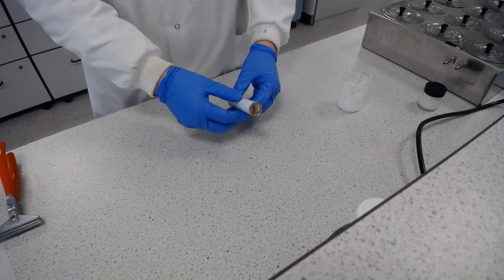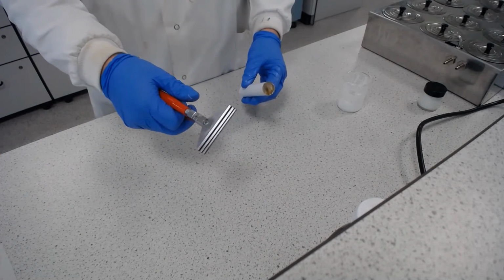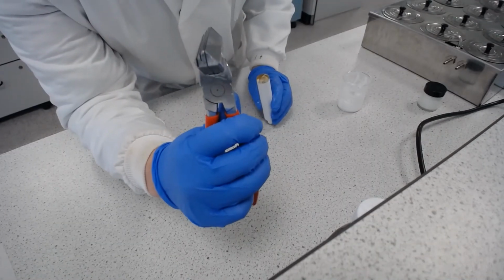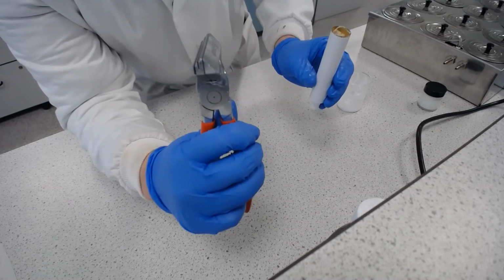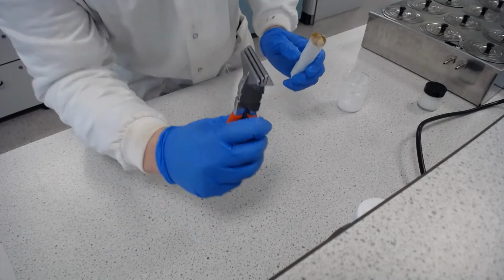So I would call that crimping the end. And on bench scale, we're just going to use these crimpers to do so. If you look at these, we've got essentially like a plier, and then on one side we've got two grooves. So once we squeeze the end of this together, we can put the flat end in there and turn so we get the little flap at the back of the tube the right depth.